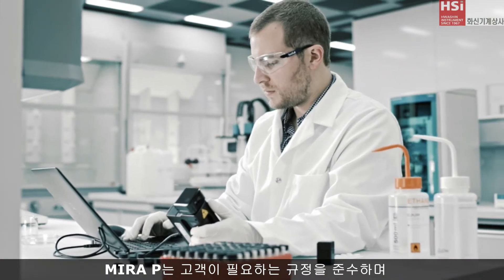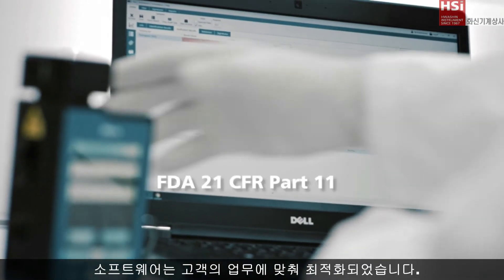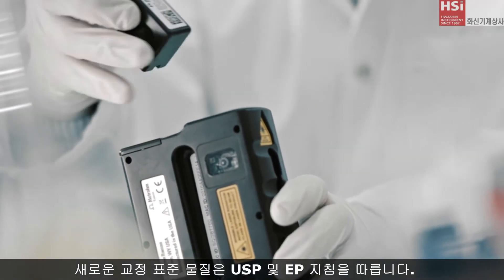MiraP provides you with the compliance you require, and the software is designed around your daily routine. Our new calibration standard follows USP and EP guidelines.